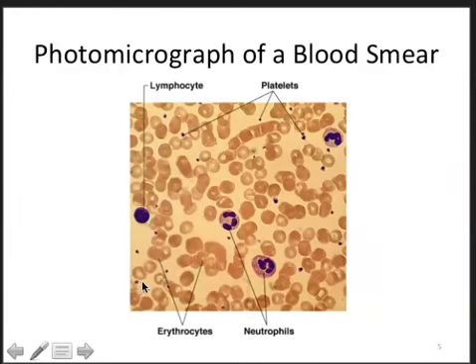purple with this dye that we use to treat blood smears in order to visualize the formed elements. They do not have a nucleus, and they contain large amounts of proteins called clotting factors, and this helps when we're injured to keep us from bleeding to death. You would mistake them almost for dirt if you didn't know that in fact those were platelets.